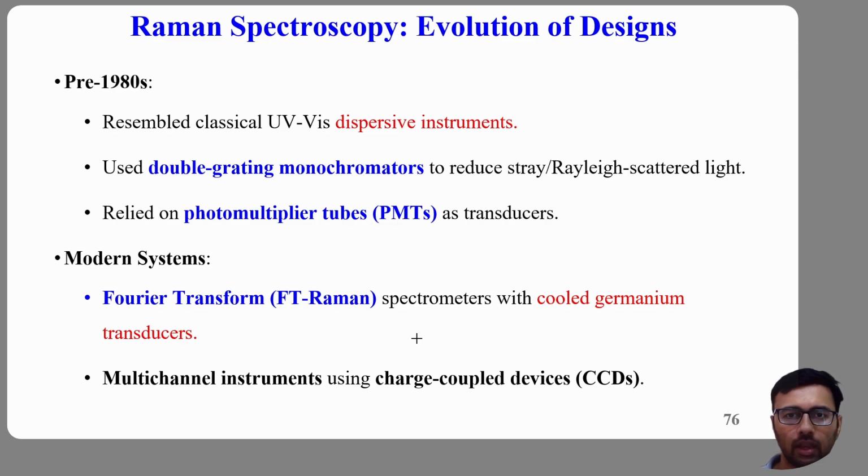These are extraordinary notch optical filters designed to block exactly one wavelength, the laser wavelength. They act like an optical brick wall. They reject over 99.9% of the Rayleigh light while transmitting the shifted Raman wavelength. This allows the weak Raman signals to reach the detector clearly.